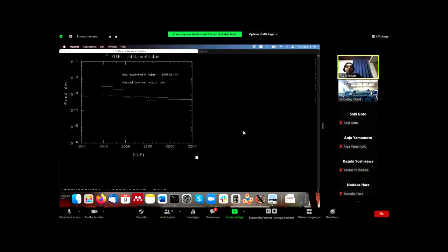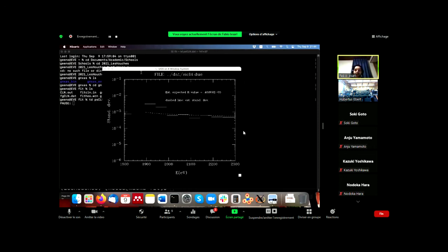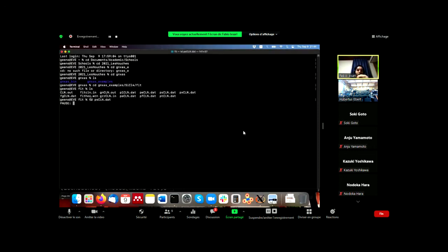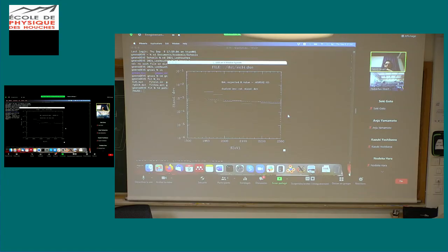Yes, okay. So I think you see this one, no, on your computer, if you do it. So if you do TDPS, you should see this window. So these bars are, let's say, the estimated noise in various intervals of your experimental data. And then this dashed line is the estimated standard deviation using weight 1.